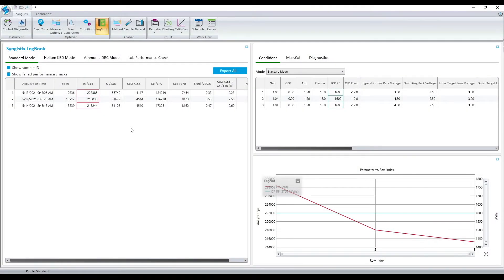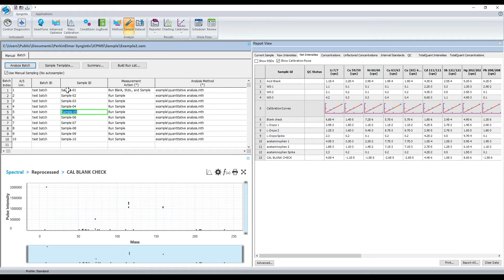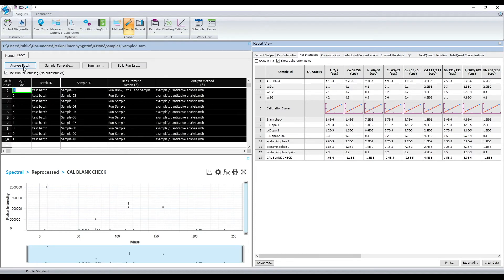Now that the system has passed its performance check, we can proceed with the sample analysis. Samples can be analyzed one of two ways: manually or batch-wise. Today I will demonstrate the batch analysis function. To run these samples, you simply click on the top left corner to select them all and then click on the Analyze Batch button.